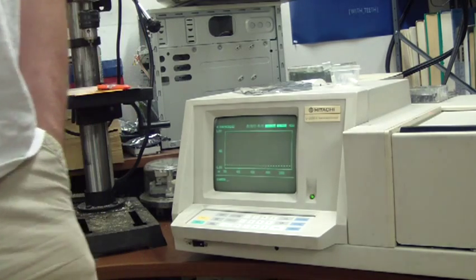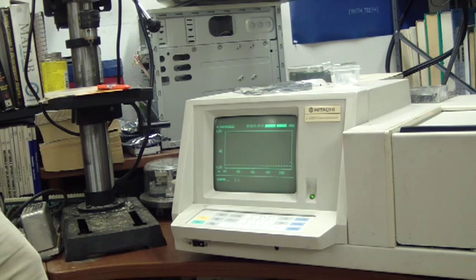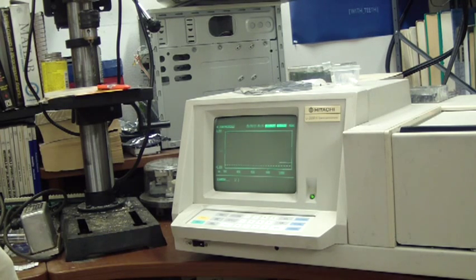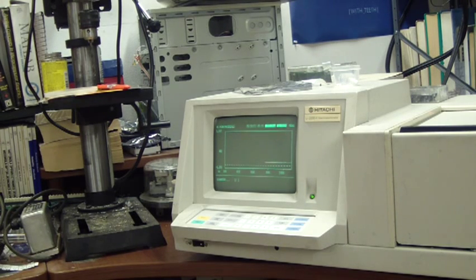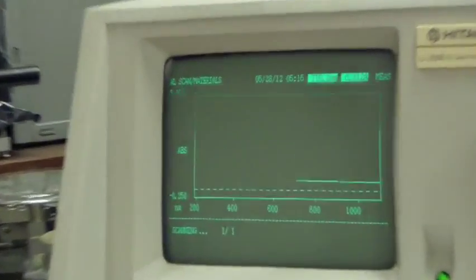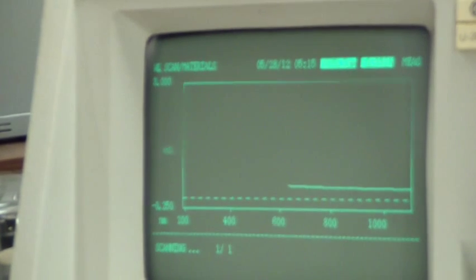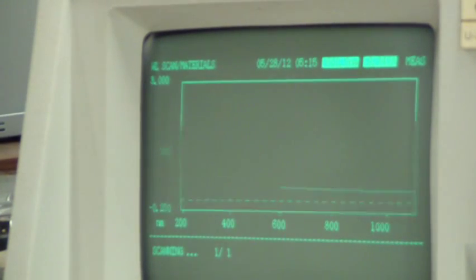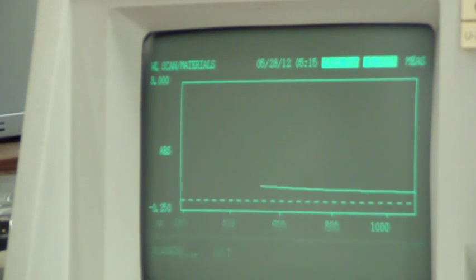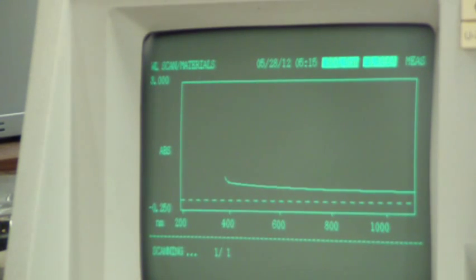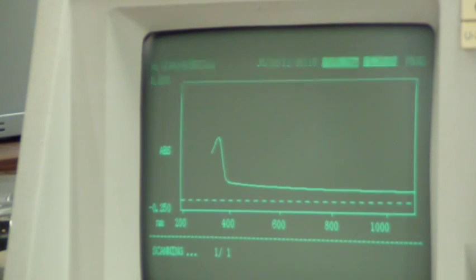I have noted a little bit of a blip about 350 nanometers. I believe one of the filters has a fingerprint on it. And there is the ultraviolet lamp.